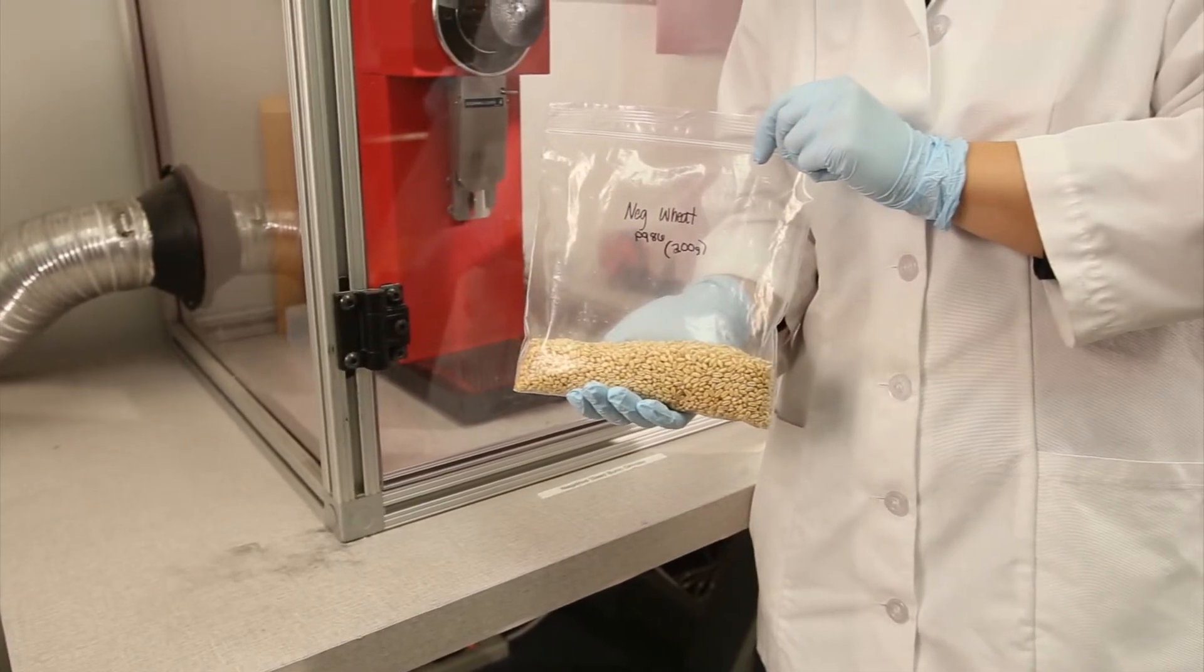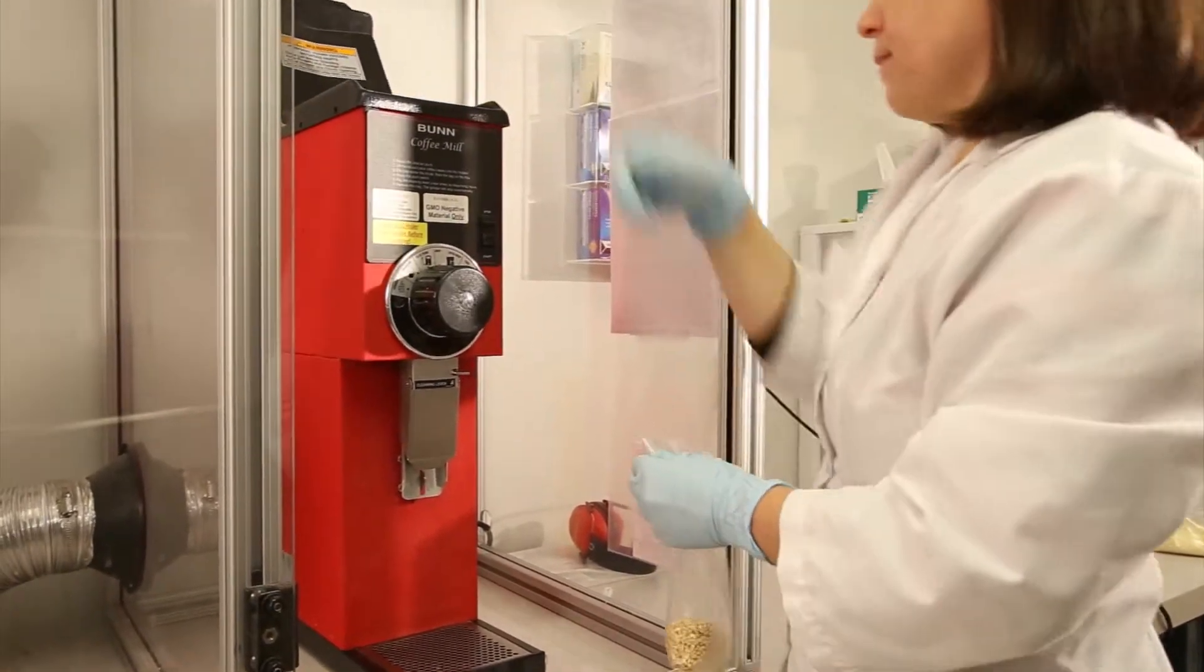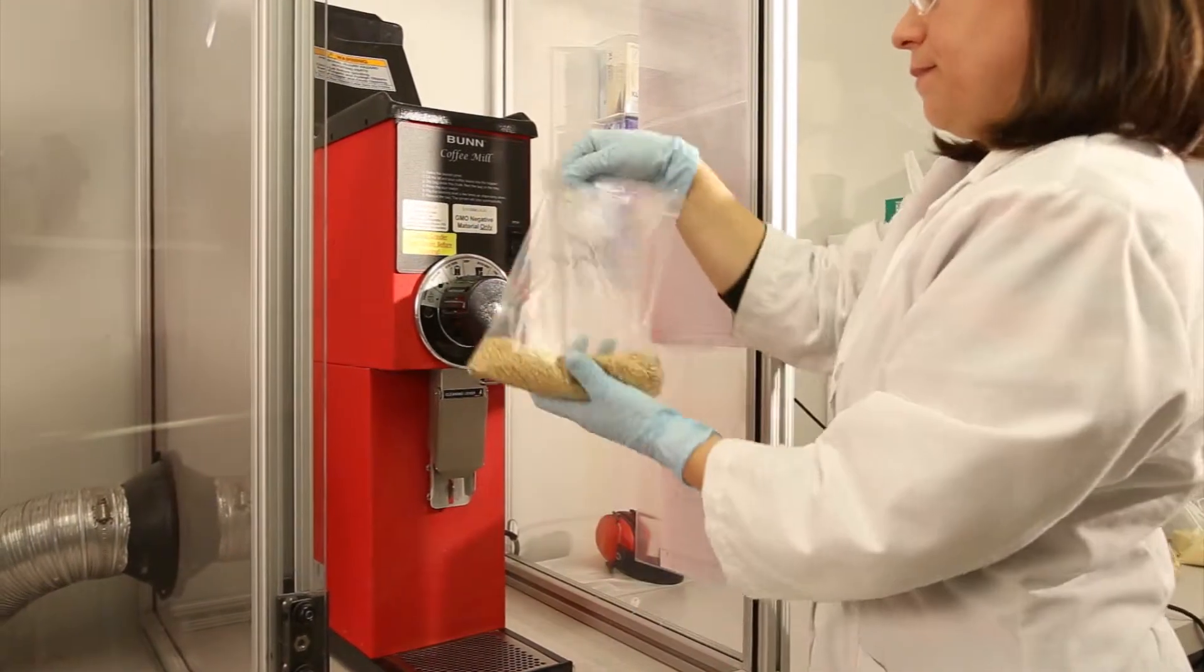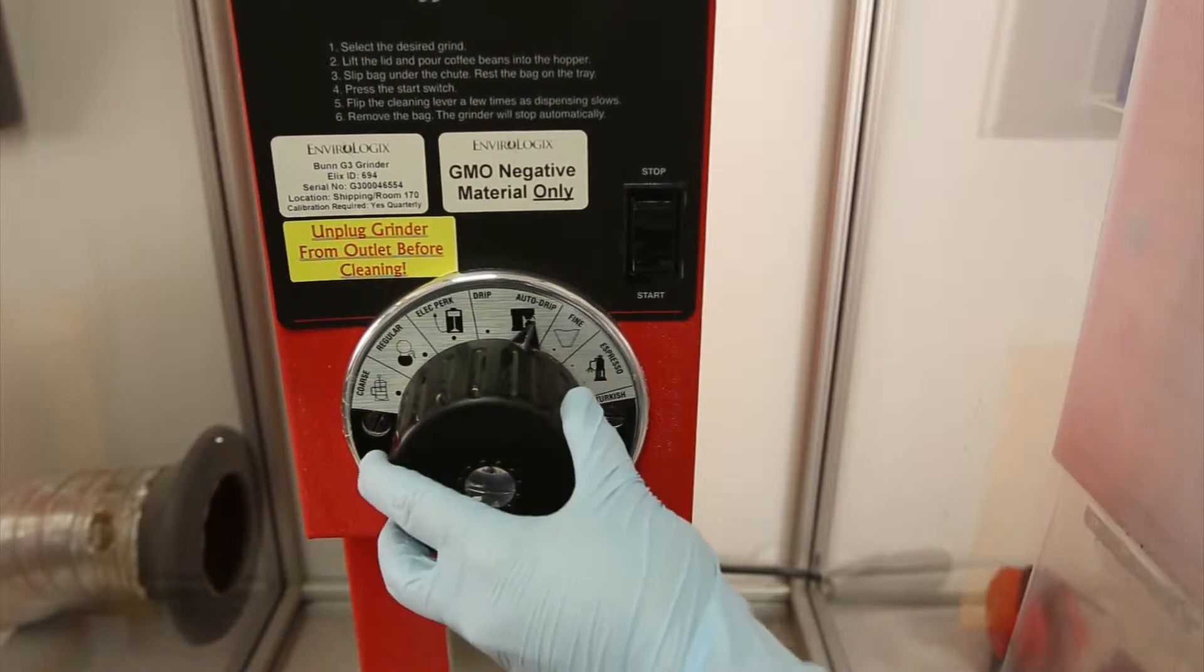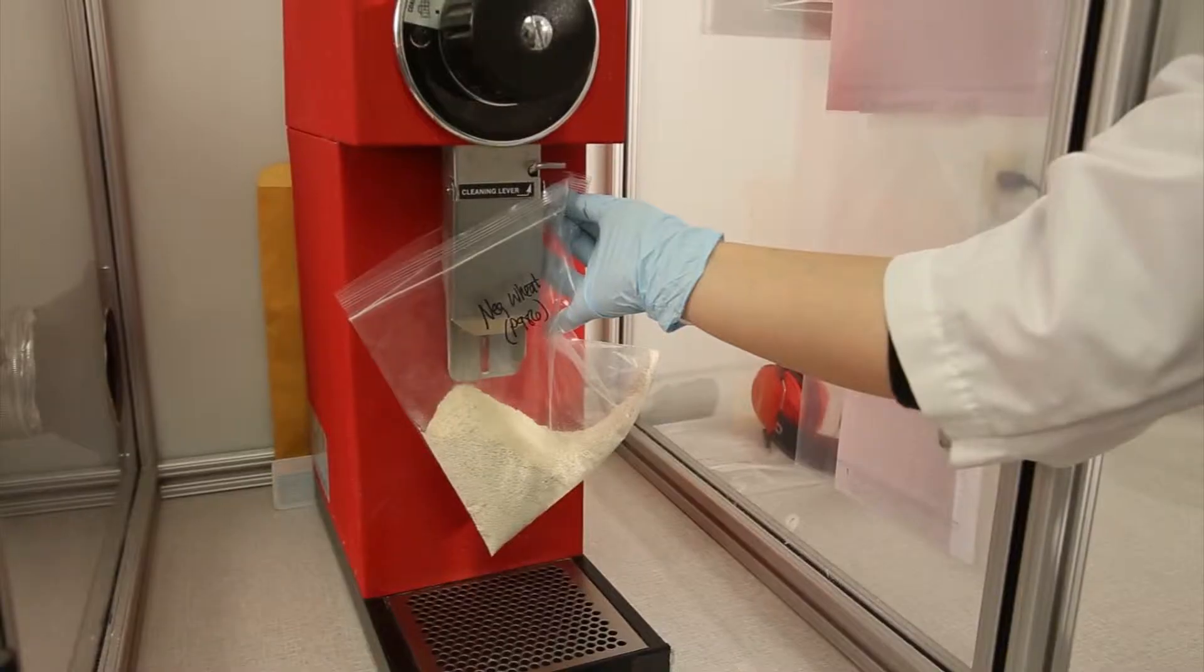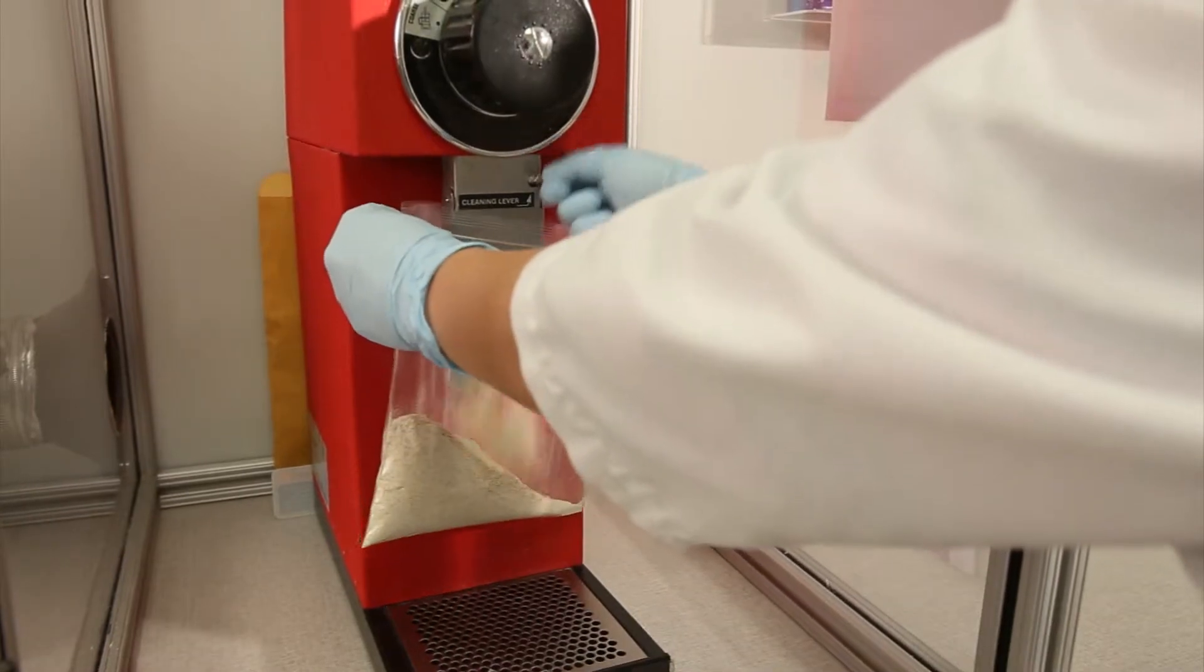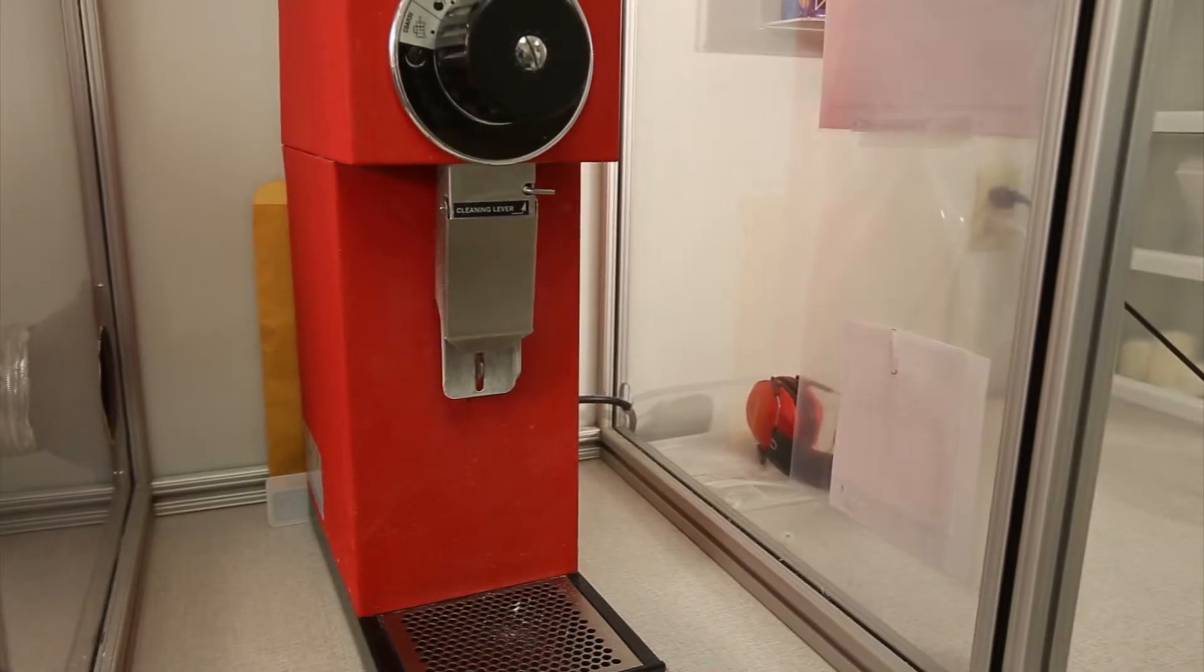Take a representative sample of grain to GIPSA or USDA guidelines or to your own internal specifications. Set a commercial bun grinder to the Turkish setting and grind the sample. Gently pull the release lever to ensure that most of the sample is cleared from the grinder.